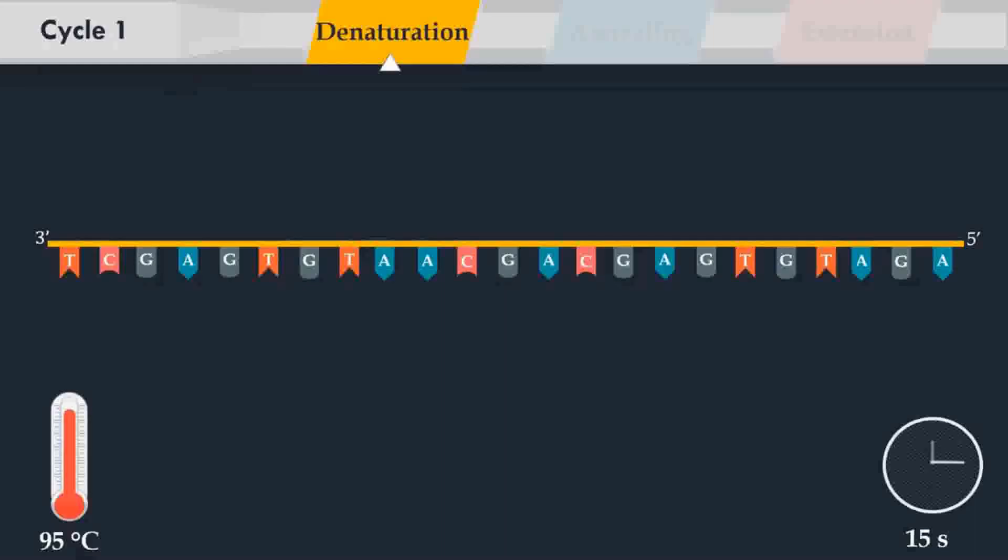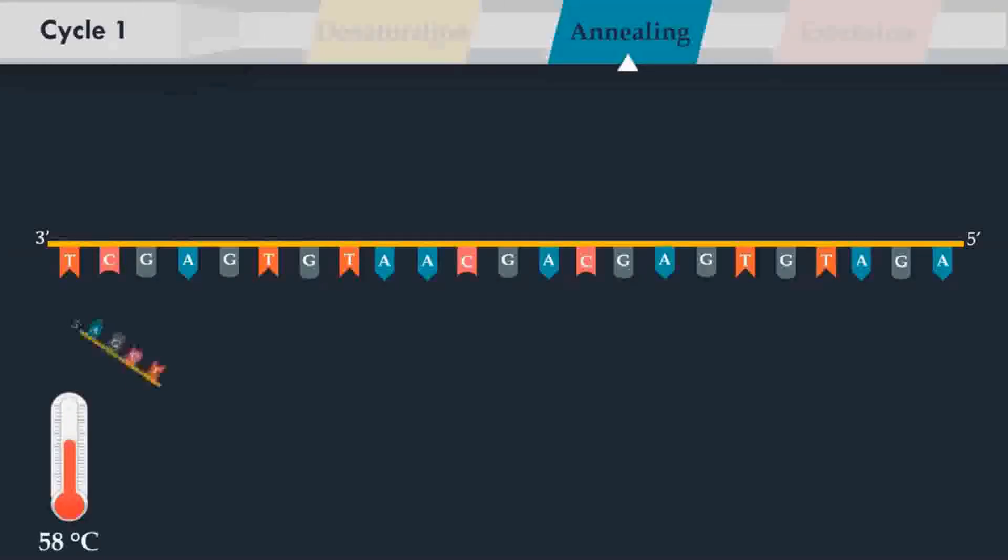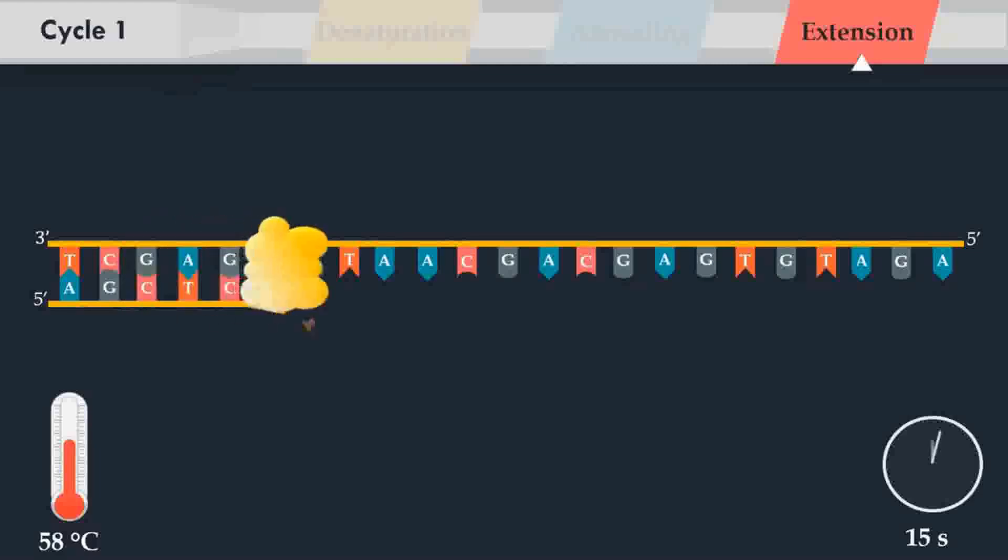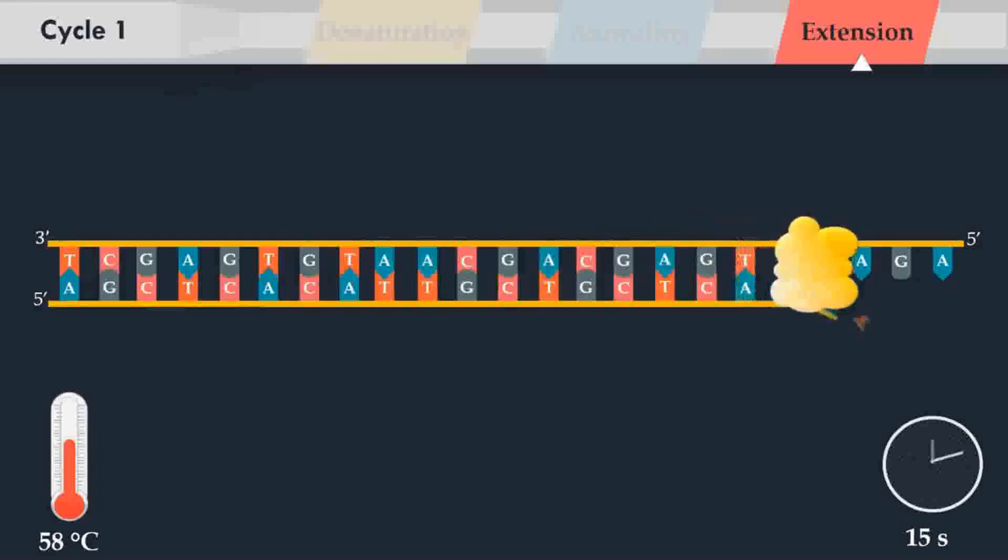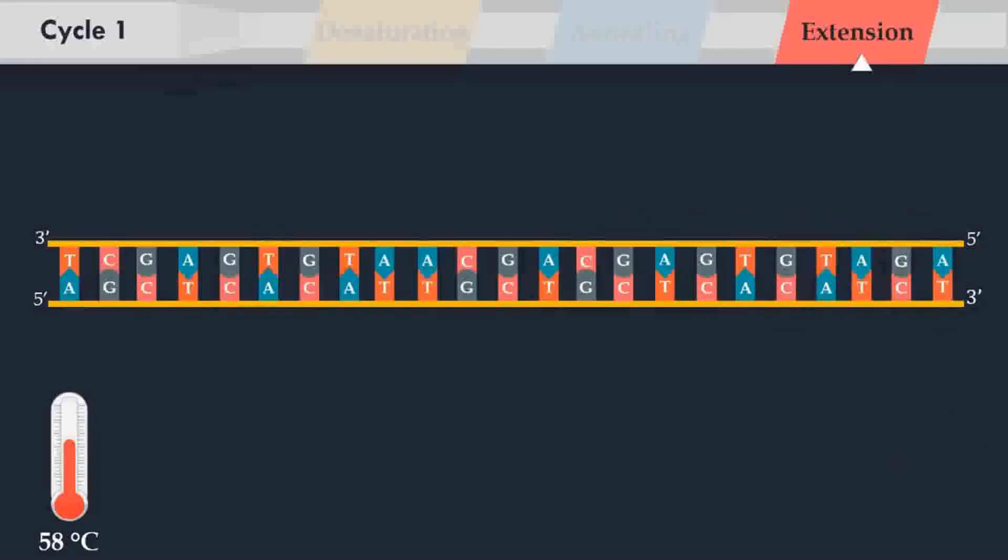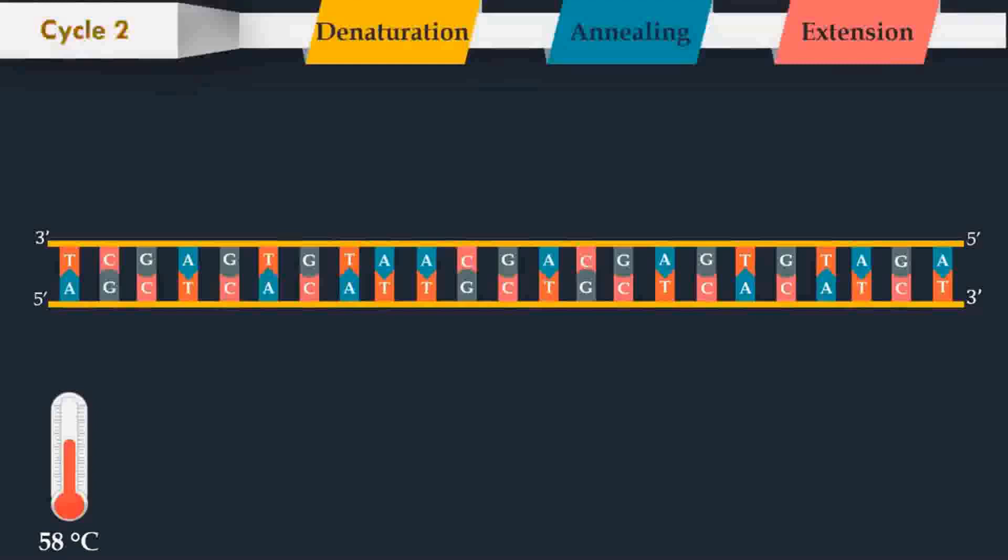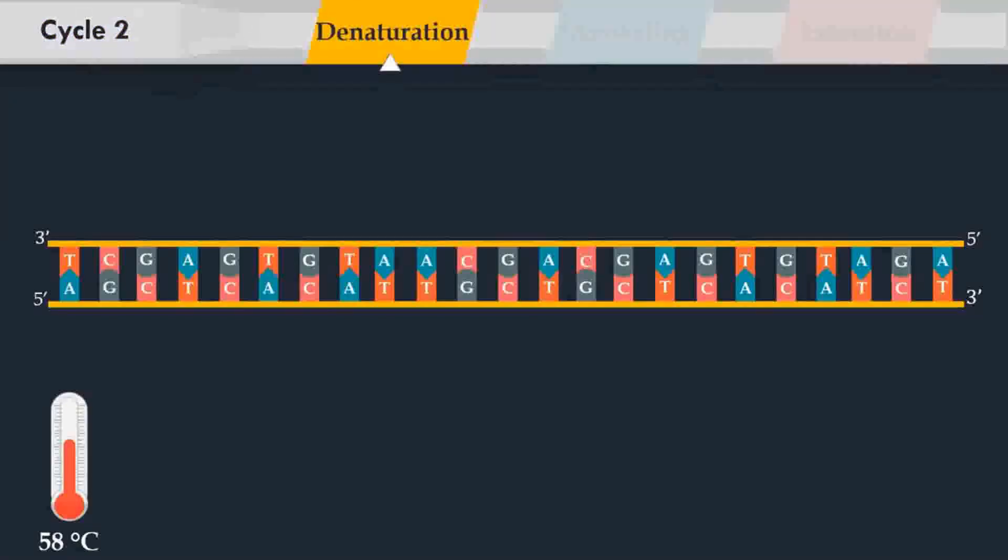Denaturation step consists of heating the reaction chamber to 95 degrees Celsius and is used for denaturation of the double-stranded DNA template. In the next step, the reaction temperature is lowered to 58 degrees Celsius, allowing annealing of the forward primer to its complementary part of the single-stranded DNA template. The annealing temperature relies directly on length and composition of the primers. In the extension step, the DNA polymerase synthesizes a new DNA strand complementary to the DNA template strand by adding free nucleotides from the reaction mixture that are complementary to the template in the 5' to 3' direction. The temperature at this step depends on the DNA polymerase used.